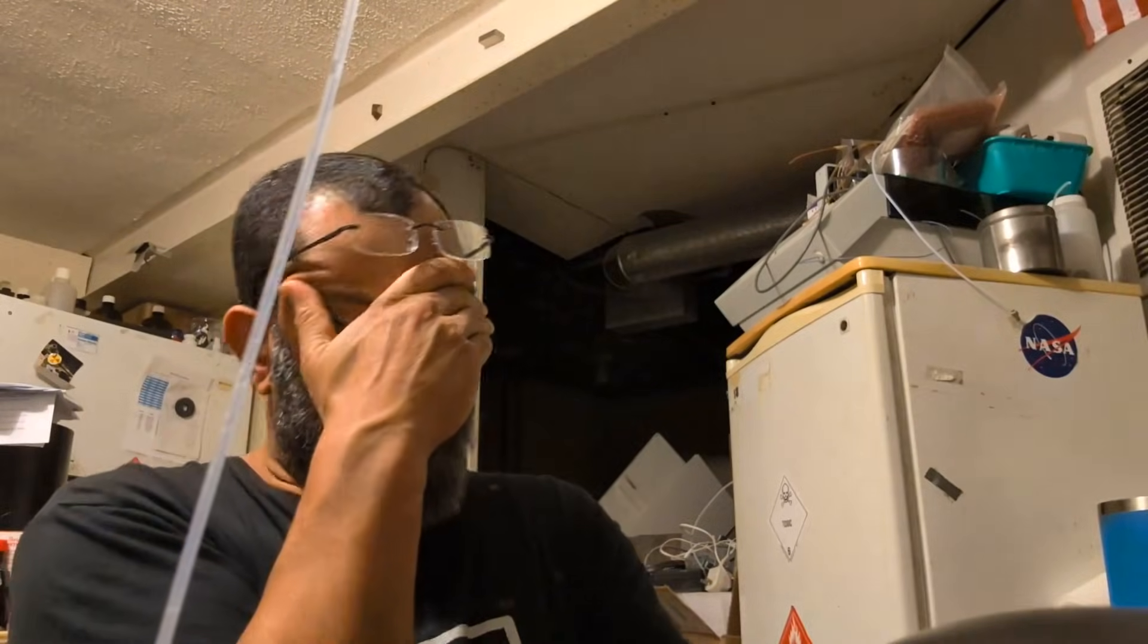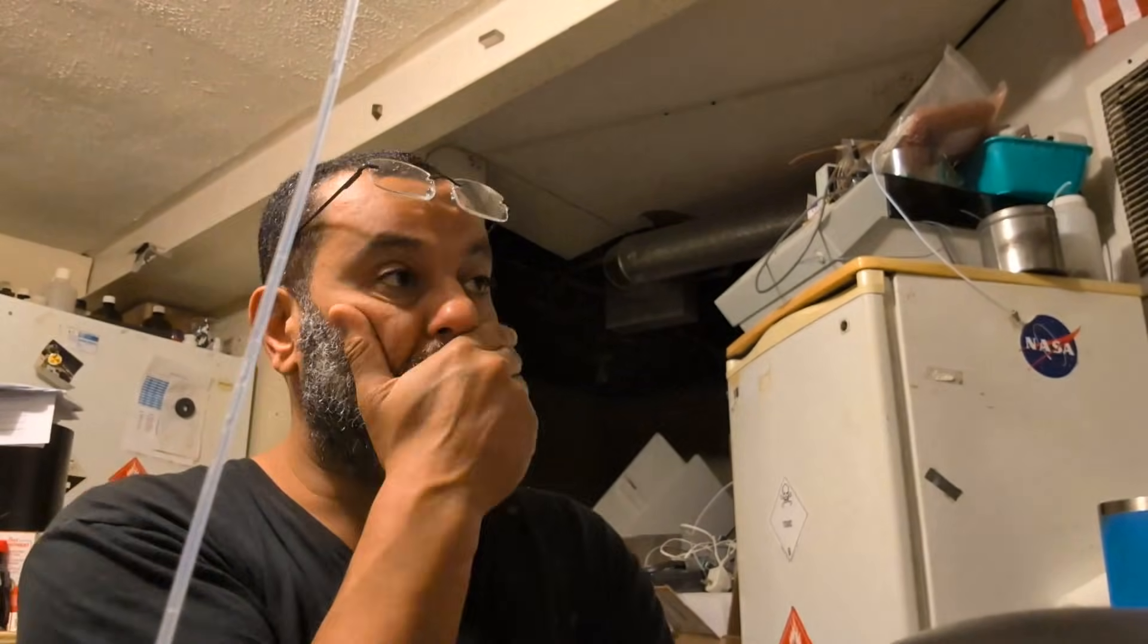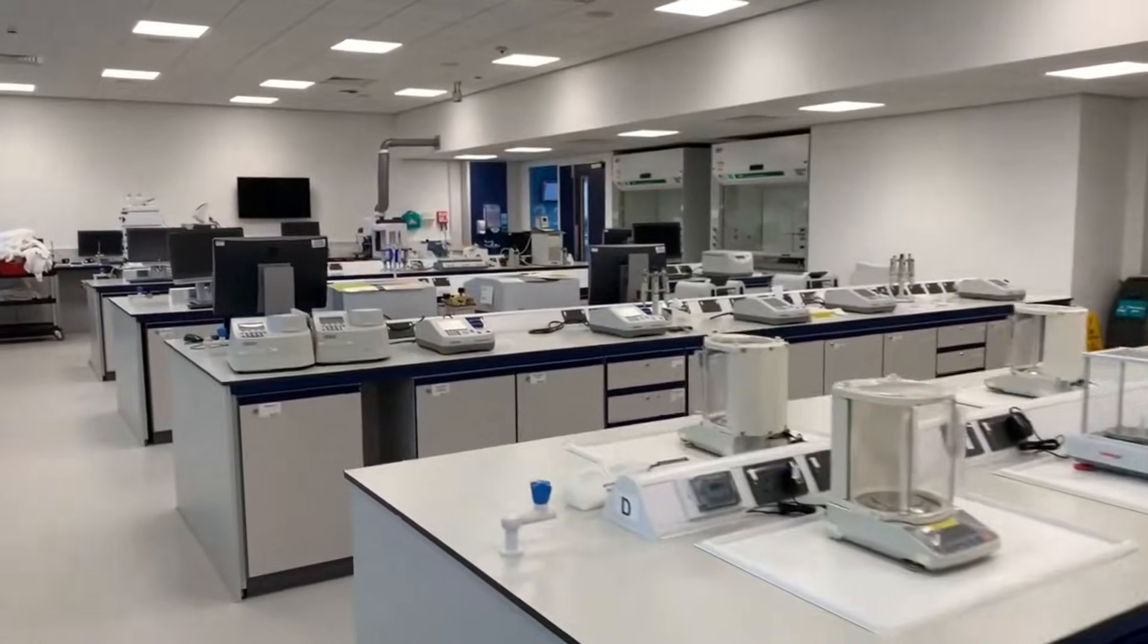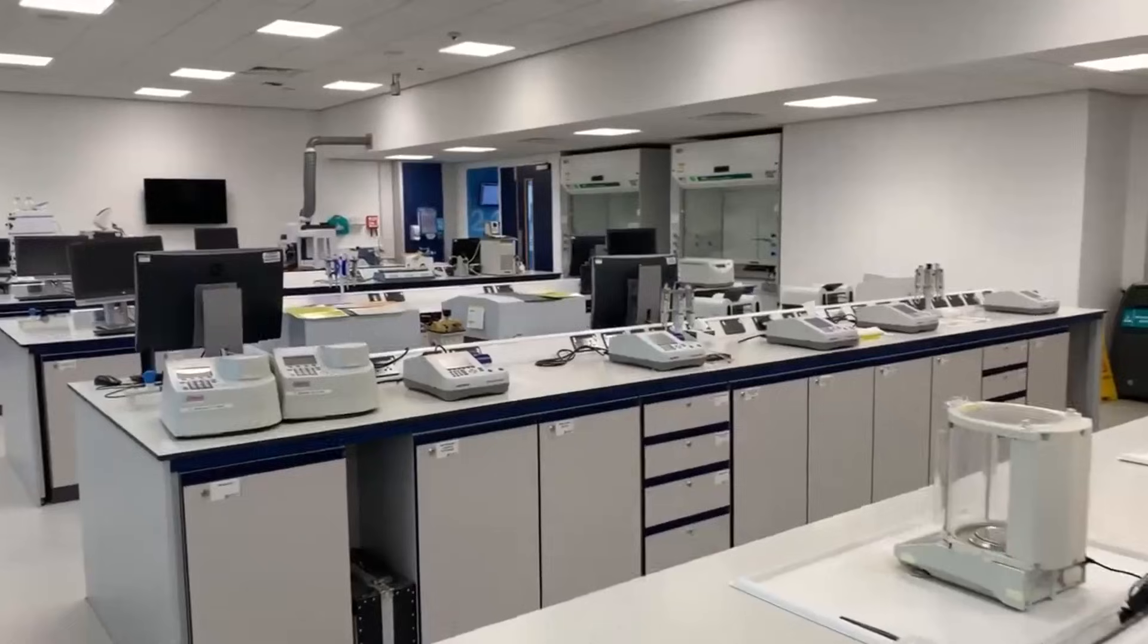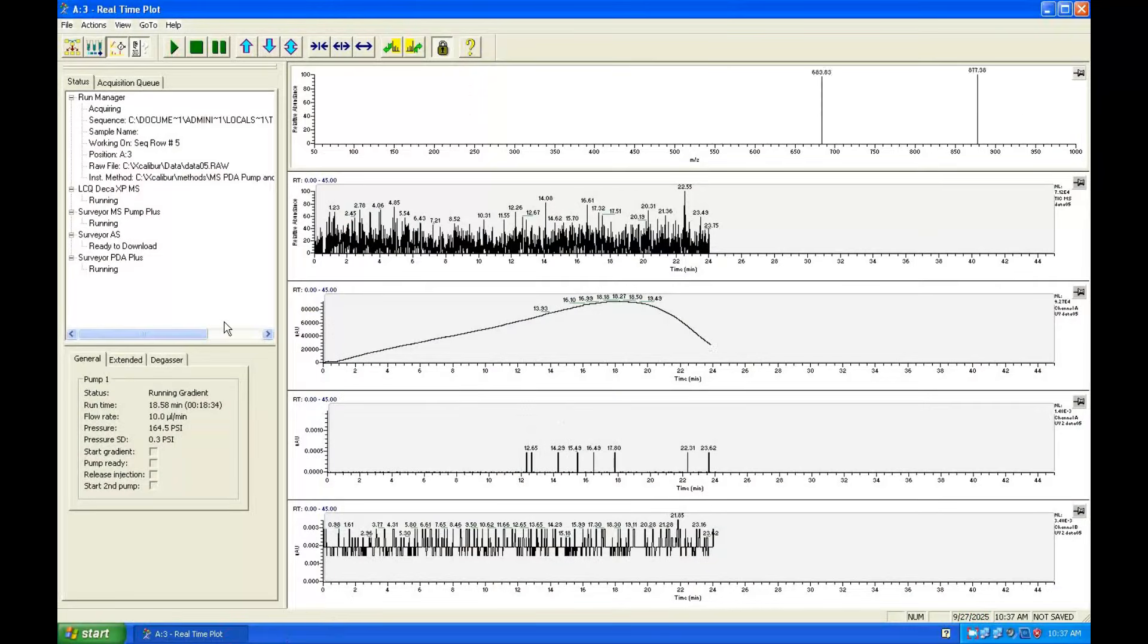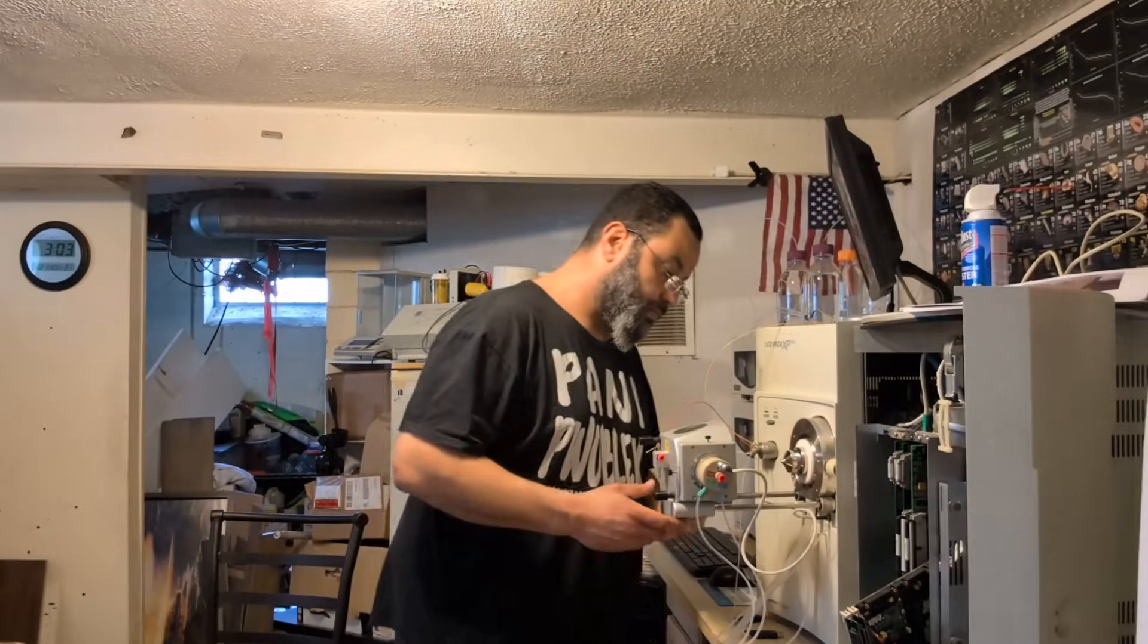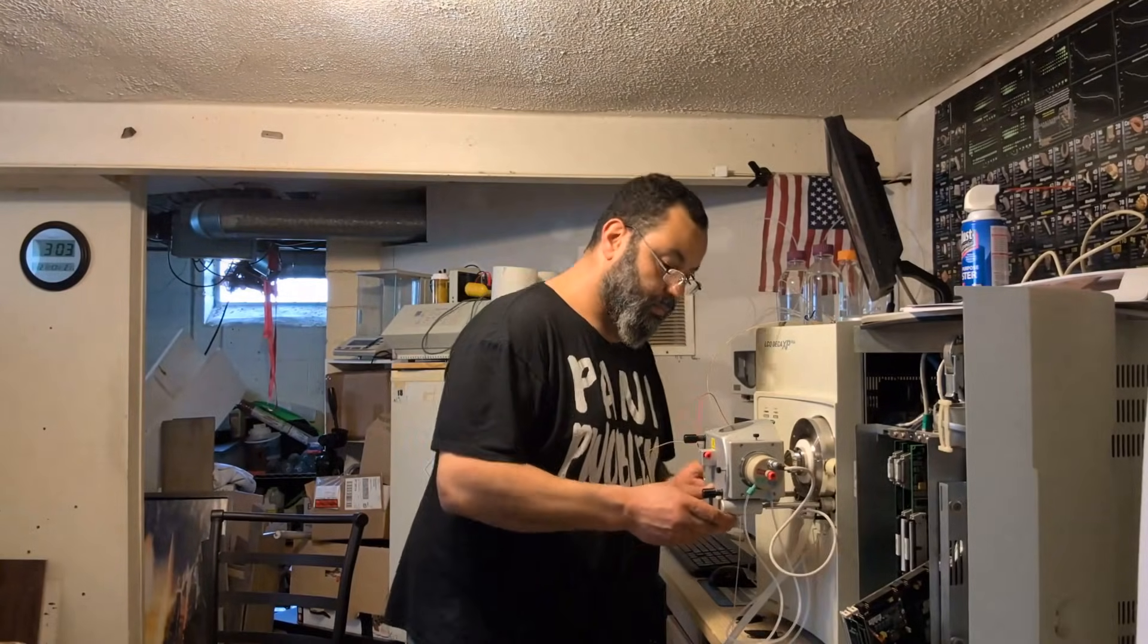I know this is a complicated process, but there's a reason why these instruments are used in forensic investigation, pharmaceutical formulations, food science, and so much more. Now if a pre-separation by chromatography is performed before the mass spectrometer analysis, we now have a way to see a lot of stuff. Making all this work together is a different story.